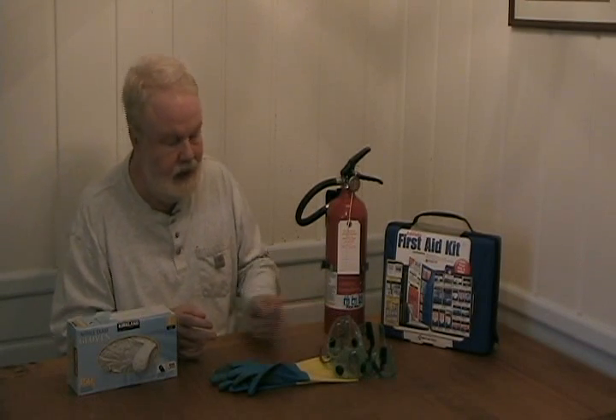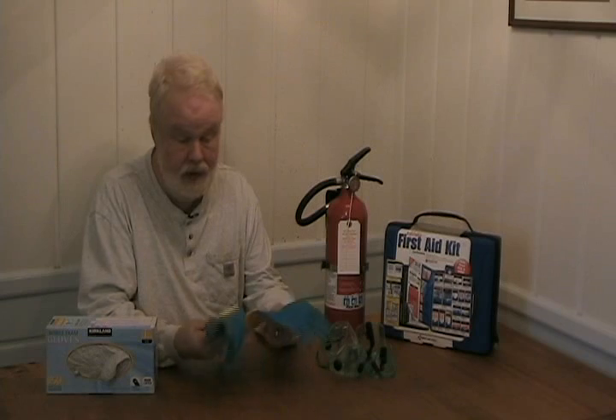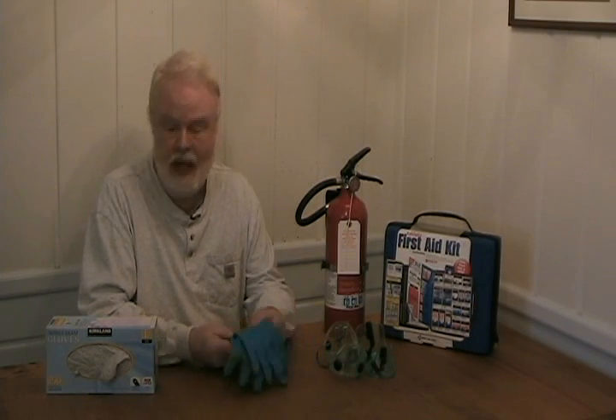The second aspect is gloves, to keep toxic and corrosive chemicals off your hands. Basically there are many different types of gloves used in labs, but the two most common in home labs are disposable gloves like these, and what may appear to be just general household gloves which are also sold by laboratory suppliers. We generally use the disposable gloves. They come in two sorts: latex gloves, and these which are called nitrile — n-i-t-r-i-l-e — gloves.